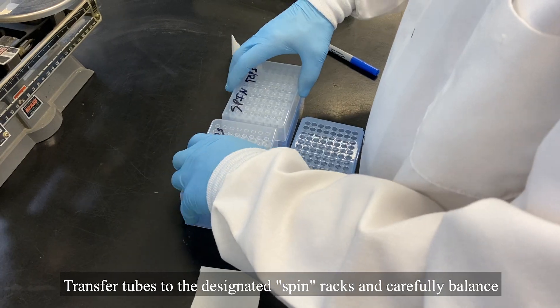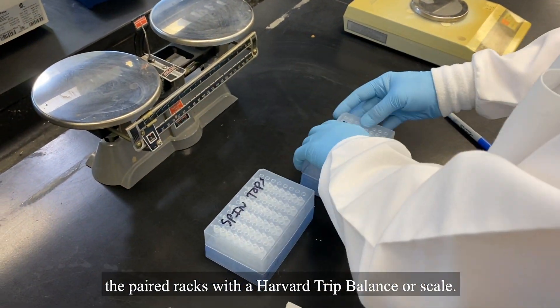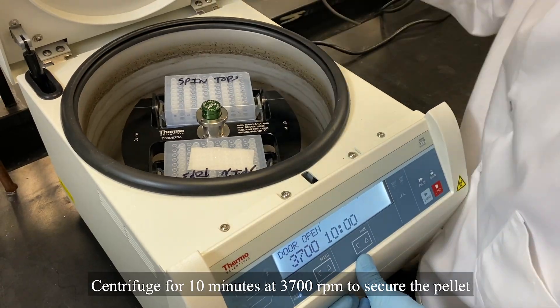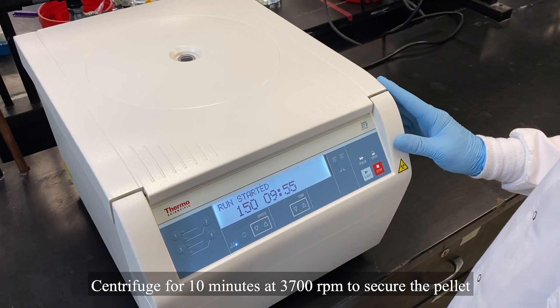Transfer tubes to the designated spin racks and carefully balance the paired racks with a Harvard trip balancer scale. Centrifuge for 10 minutes at 3700 RPM to secure the pellet at the tube bottom.